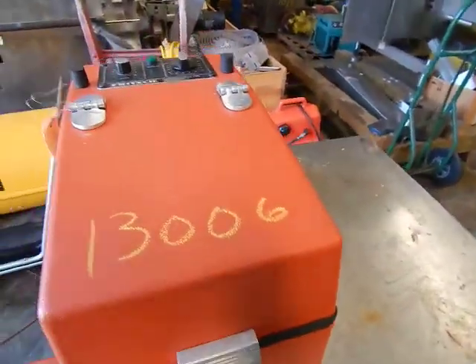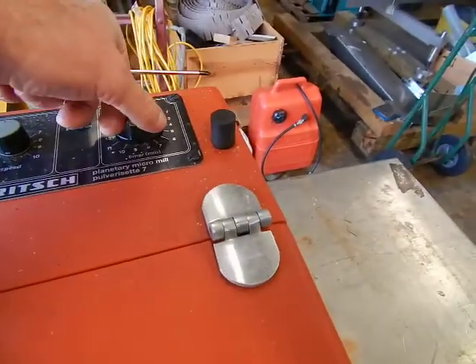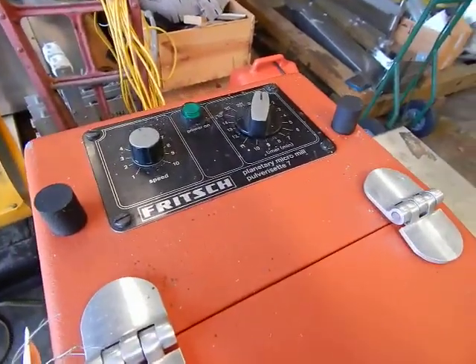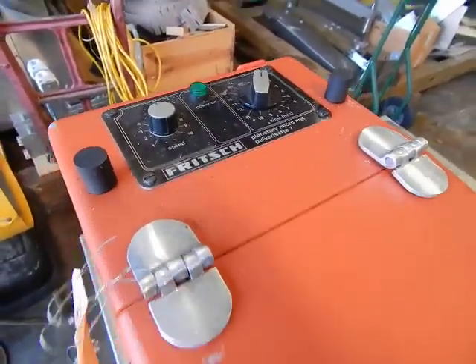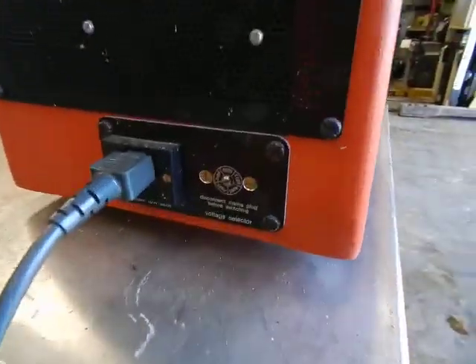The machine will not operate unless the cover is in the closed position. The timer does work. We have the speed control right here. Once we kick the timer on for just a minute, you'll hear it turn right up. You'll see the power light is not operating — it needs a new power light.